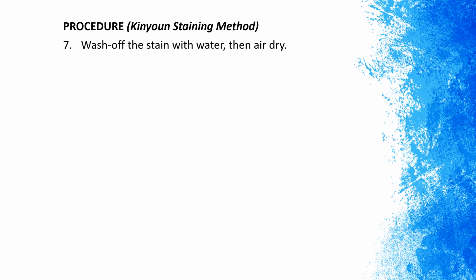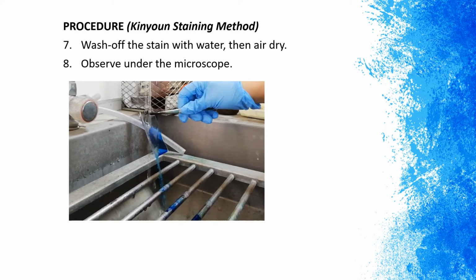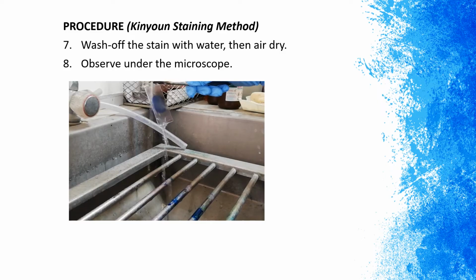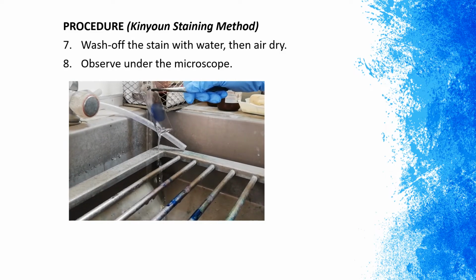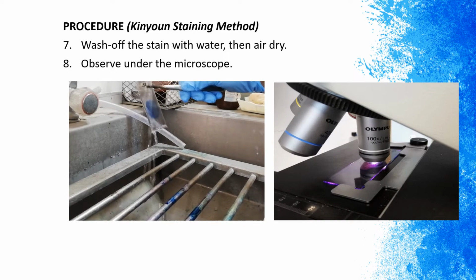After that, wash off the stain with water, then air dry. So after washing the stain with water and air drying, observe your slide under the microscope.